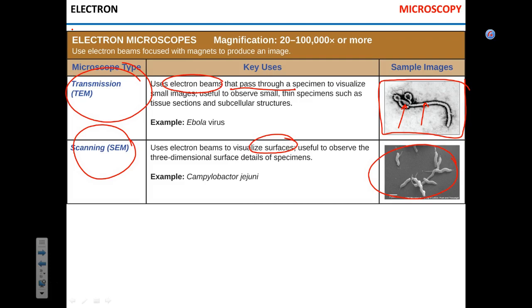Makes sense, right? Now, if you Google scanning electron microscopy images, you will see perhaps the most beautiful images taken by science ever. If you Google transmission electron microscopy, those are most unremarkable. They're really boring, but they're really valuable. Okay? Why I said that this should be updated.